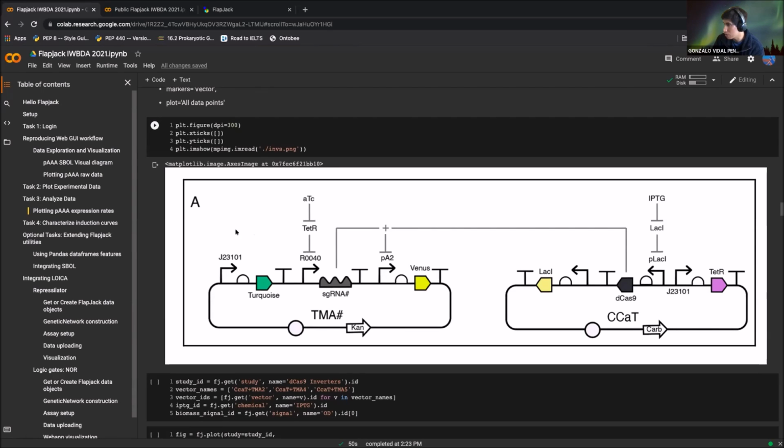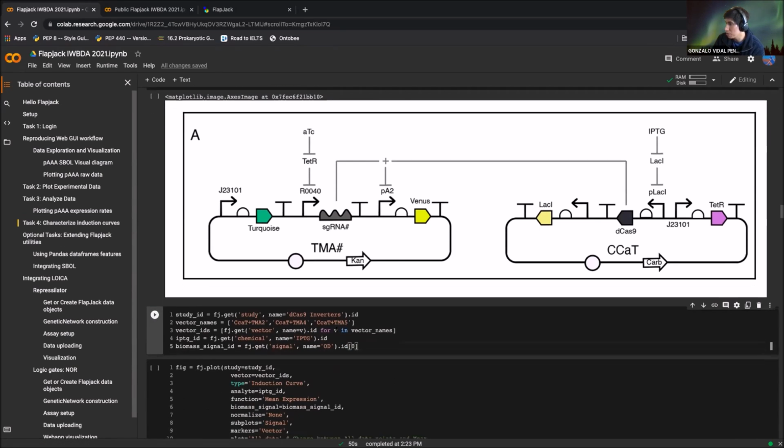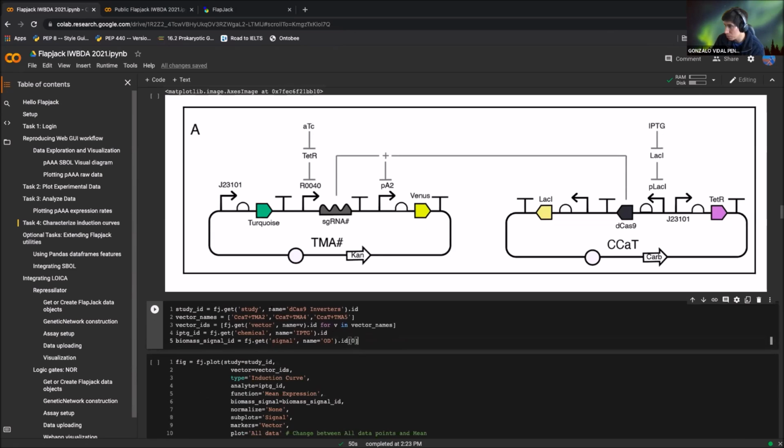We also need a transcriptional unit for the repressor. So we have here first J23101 as a kind of ratiometric one, a control of how the system is behaving. And here we express LacI and TetR under the control of J23101 as well, in order for the other promoters to work. So we need the IDs of this study.